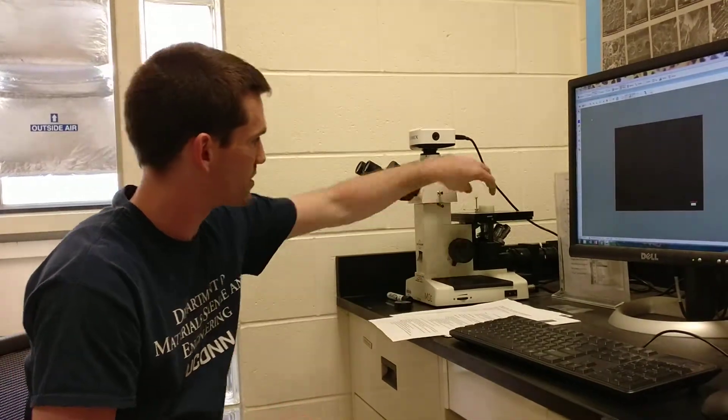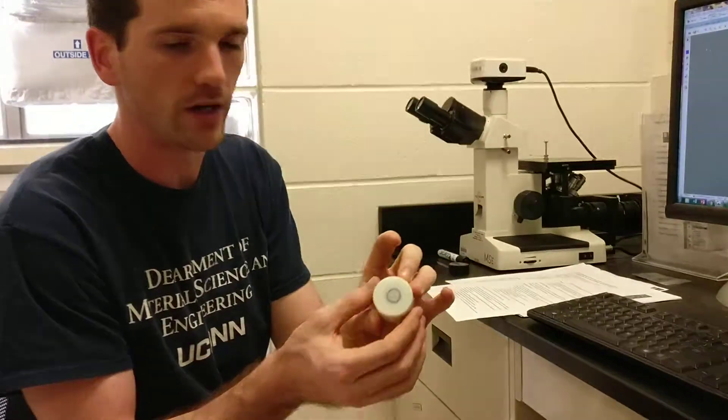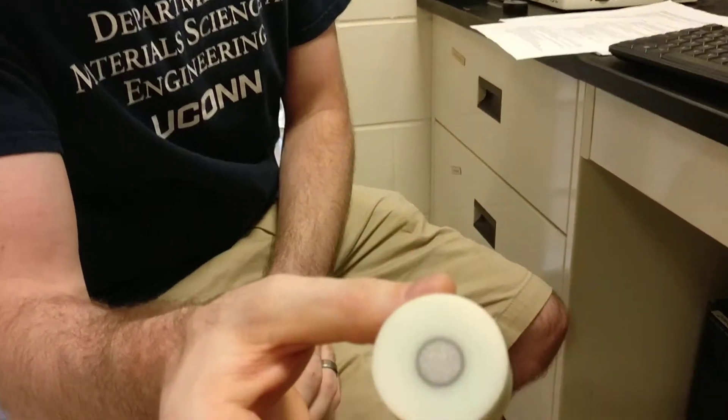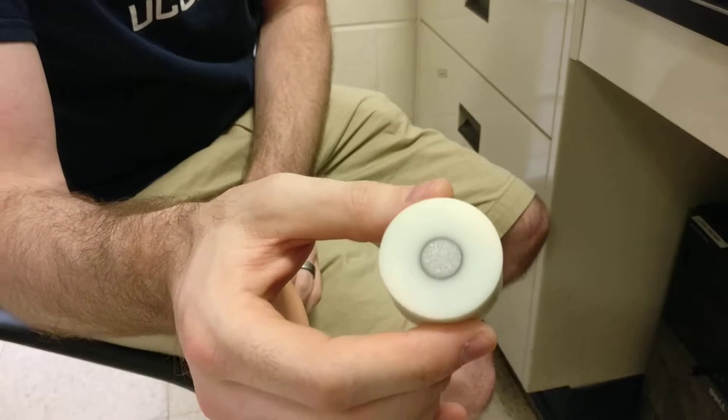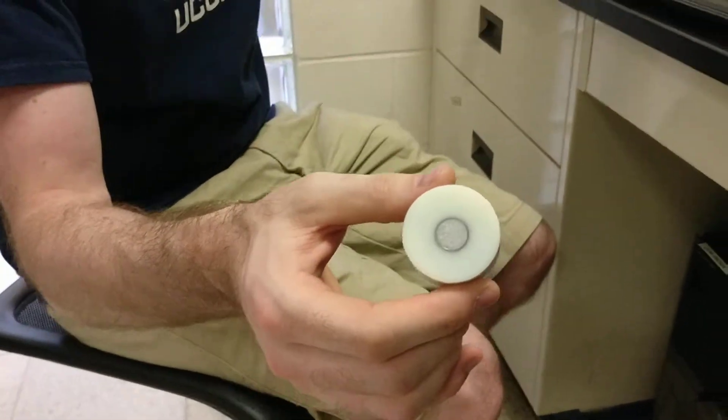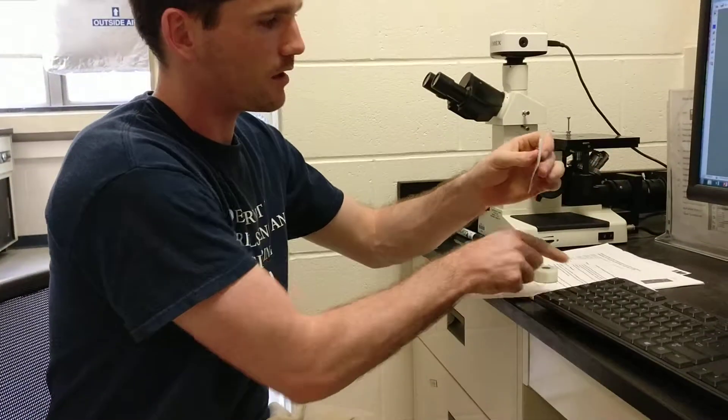The three different samples we have are a thermal barrier coating. The coating on here is very thin so it's very hard to see. The second sample we'll look at are these carbon fibers.